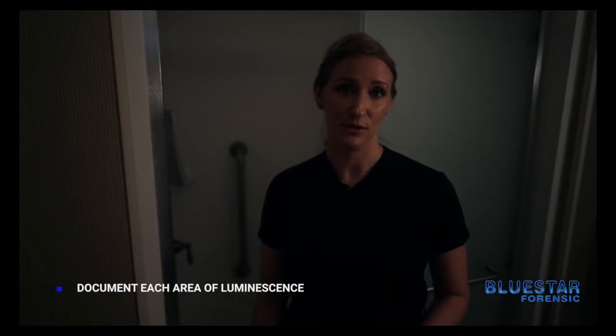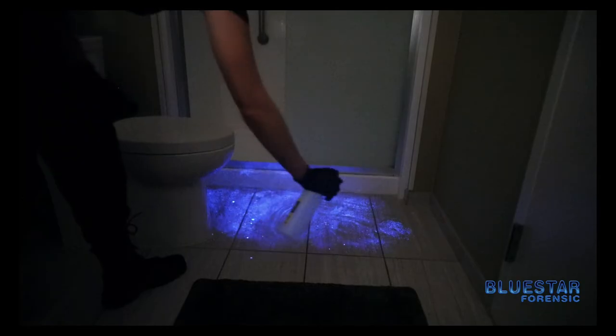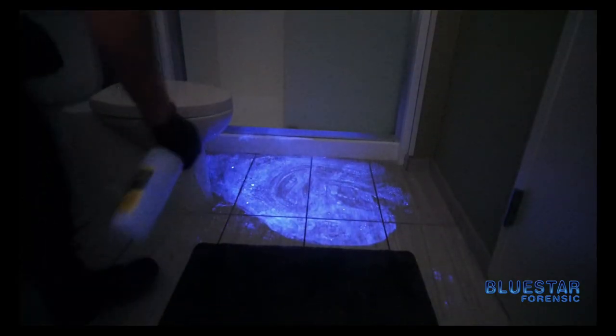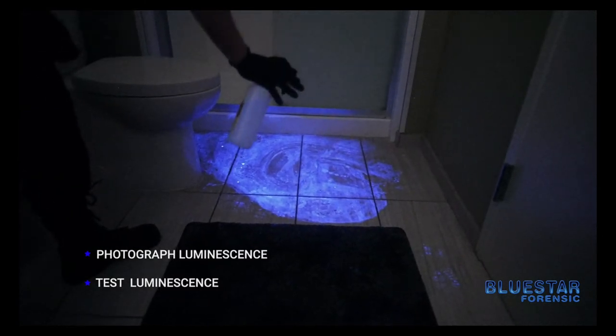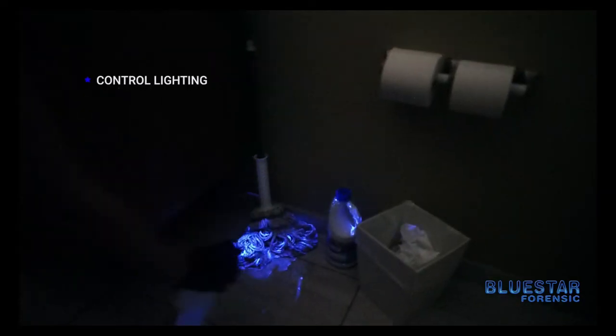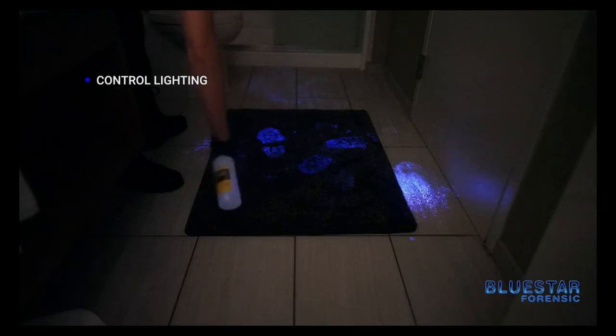We're going to start in the shower and then work our way back. In a real crime scene you want to make sure that you document each area of luminescence as you go. Once you observe the luminescence from Blue Star it should last about 30 seconds to two minutes. So at this point you would test the luminescence from the Blue Star with a blood presumptive kit. As you can see the chemical luminescence is now visible. At this point you'd want to photograph it and also test the area. When using Blue Star you do want to control the lighting in the environment because it is a lower light glow.